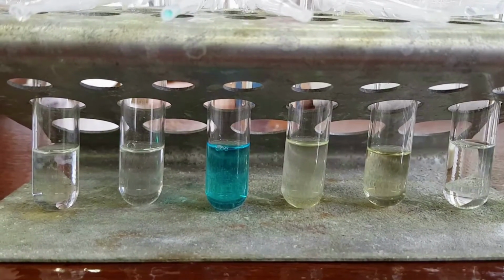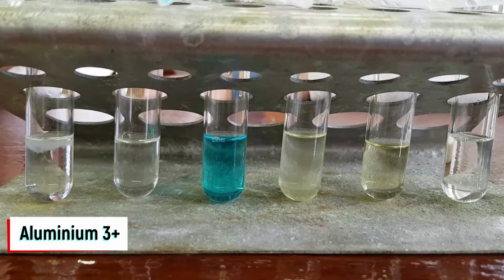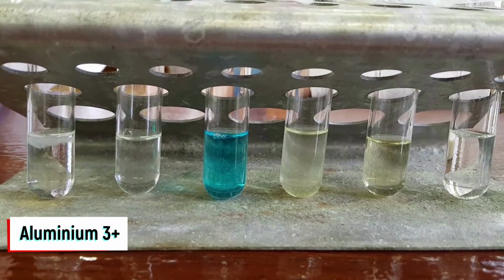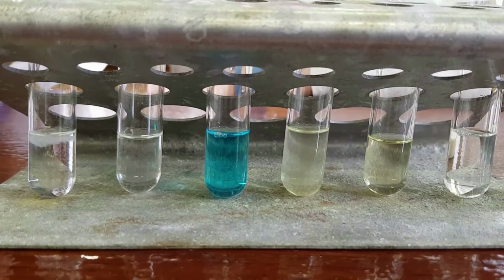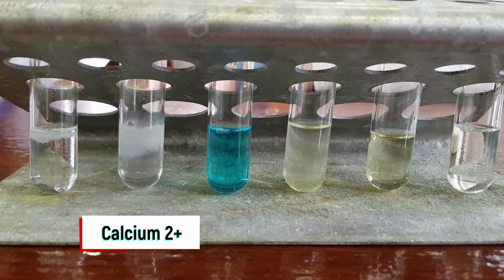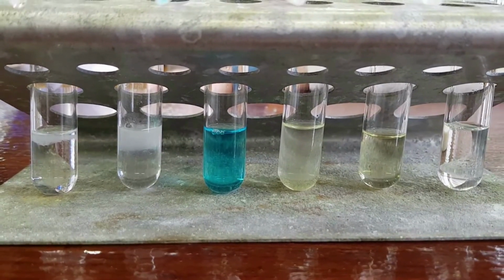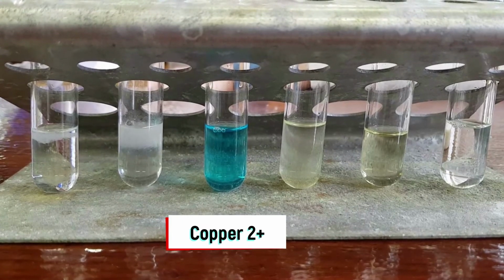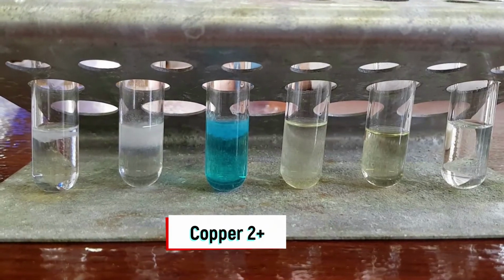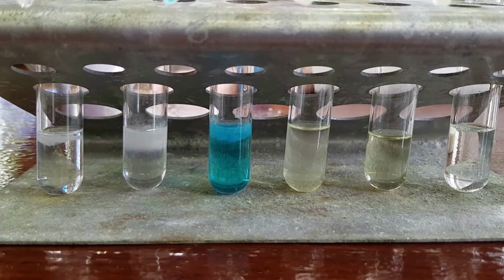So first to the aluminium sulfate solution on the left. We can see there definitely a precipitate being formed, a white precipitate forming in the aluminium solution. Now sodium hydroxide being added to calcium chloride, and again we can see a white precipitate being formed. Copper sulfate, copper 2 sulfate I should say, and the copper solution is reacting with the hydroxide to form a pale blue precipitate.